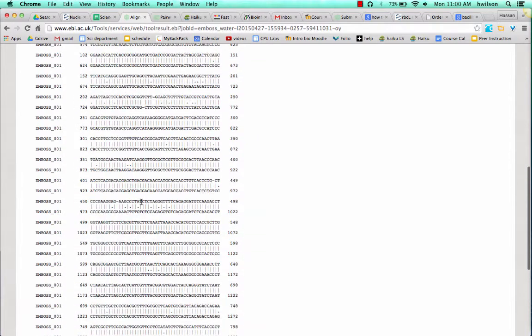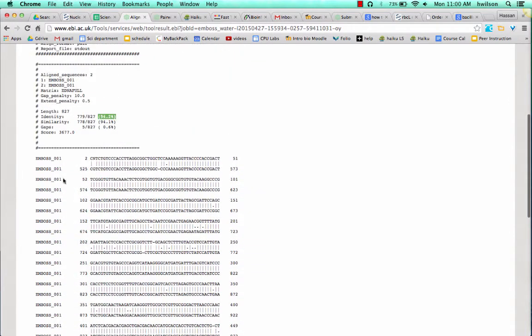You can take a screenshot of the alignment if you choose to, and you can record the percent identity.